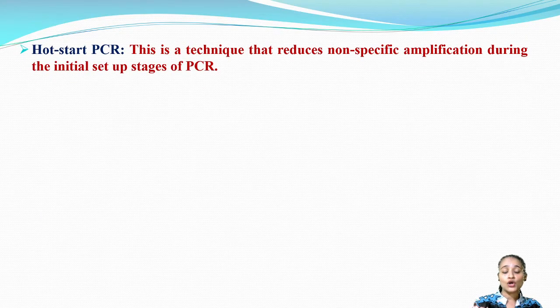Now what is hot start PCR? This is a technique that reduces non-specific amplification during the initial setup stages of PCR. This technique is commonly used in research laboratories because we don't want any non-specific amplification; we want only specific amplification of our DNA product or PCR product.